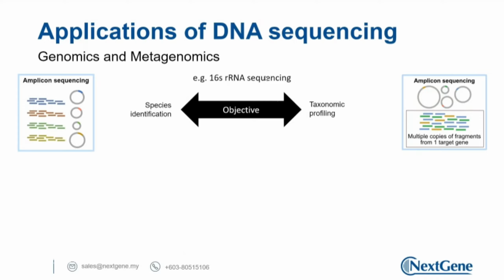In the genomic context, we want to identify the species in our samples. After we do the isolations from the mixed samples, of course, there are other methods to identify the bacteria, and molecular typing is one of them. Sequencing out marker genes like 16S will help us identify the species.